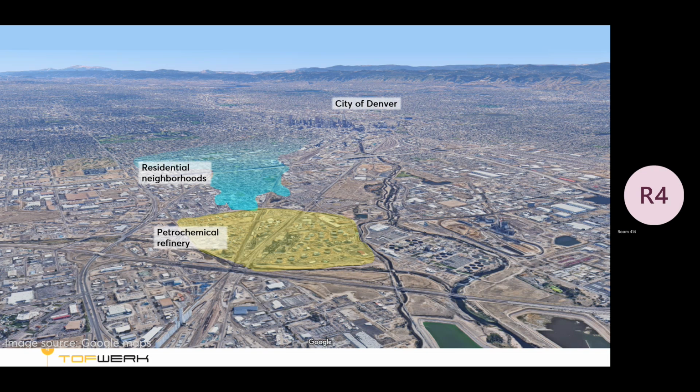I think you were showing spikes in air concentration. You look at it and it's still less than parts per million. Yeah, exactly. I spent a lot of time staring at benzene, so I do know those concentrations off the top of my head. The tallest spike of benzene that we ever saw was 150 parts per billion. The background concentrations out there are somewhere between 100 and 400 parts per trillion, which is also pretty measurable. And then the other spikes are kind of small.